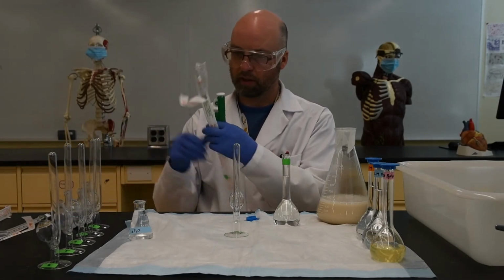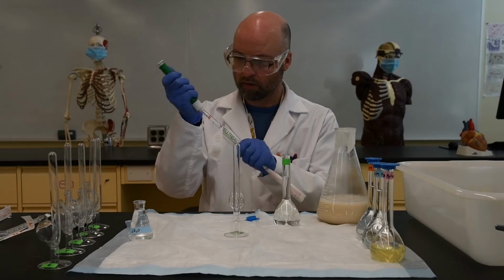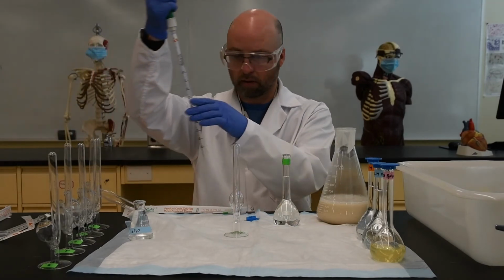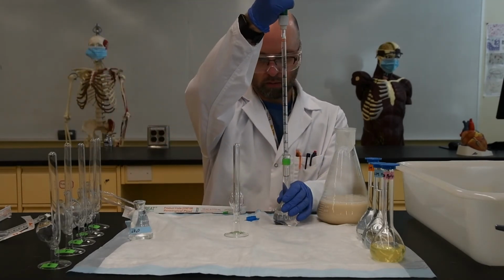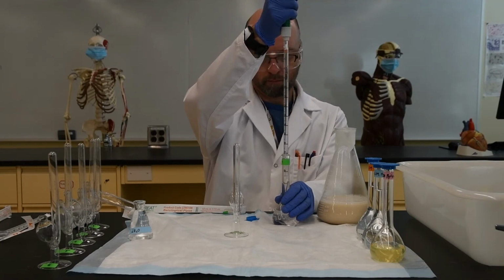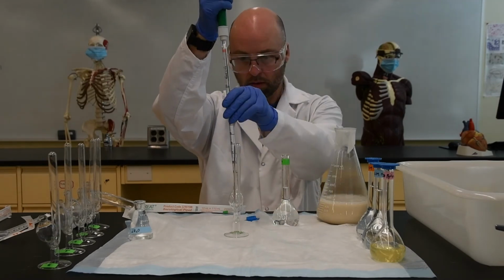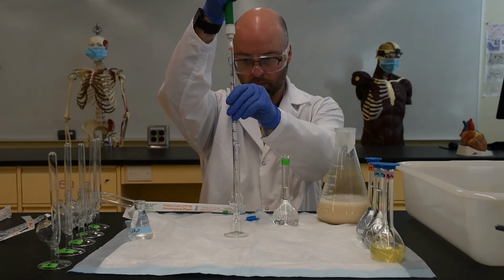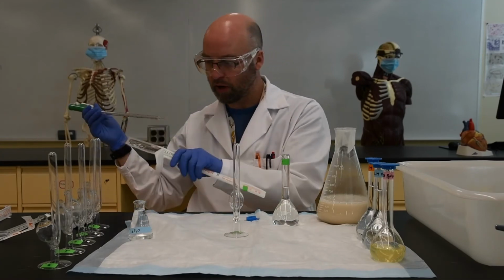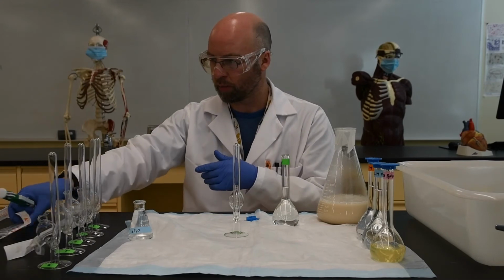We'll use these pipettes. Right. And this one also has 5 ml of water, so obviously I'm going to use a fresh pipette.